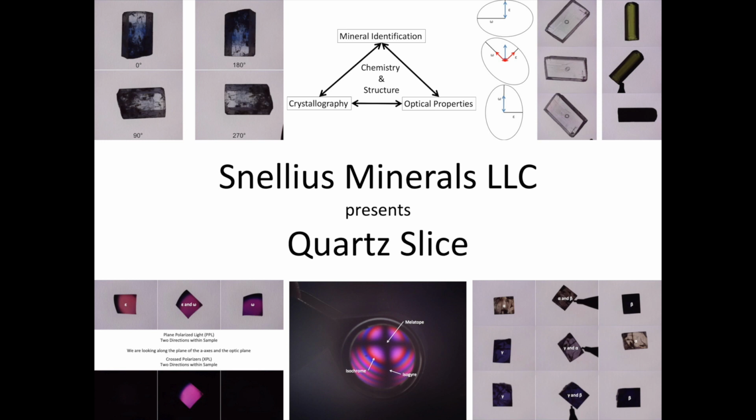Hi everybody! So in this video we're going to look at some fun experiments you can do with the quartz slice from Snellius Minerals. So the quartz slice consists of a piece of quartz that I've cut windows in so that we can actually view looking along the c-crystallographic axis and identify some pretty awesome features.